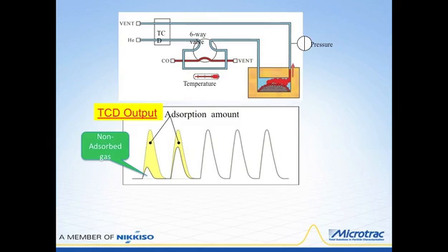Then it's necessary for the instrument just to determine the total amount adsorbed, and that would complete the measurement. But it does allow plenty of time for chemical reactions to occur and to get the best indication of the reaction and how the surface is interacting.